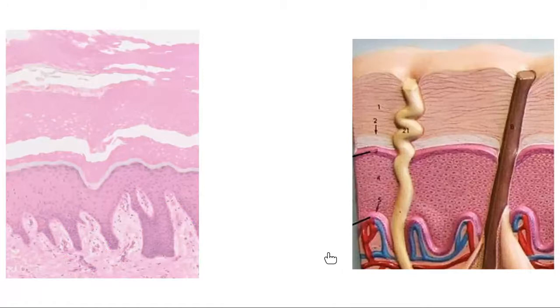That epidermis layer with those cells that we looked at, sometimes it's really thin and there's not a lot of space, but there are some places in your body where we would see a lot more layers, kind of more like this. So this is, as the guided lesson talks about, an example of what thick skin looks like. Thick skin is the kind of skin you get on places like the palms of your hands or the soles of your feet, where I need all the layers of cells. If I tried to count the number of layers of cells in this picture, we'd be in the ballpark of like 50 to 100 different layers of cells when we're looking at this tissue.